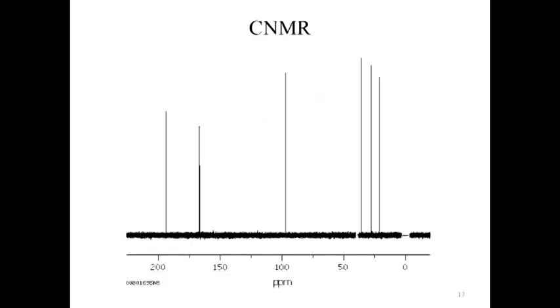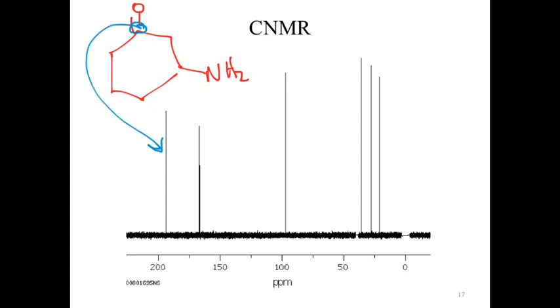Within our carbon NMR, I don't have anything extra to add to this, unfortunately. It is what it is. We could go through and look at our structure and verify that we've got indeed exactly what it asked for. We have 6 completely unique and distinct carbons. We've got our carbonyl carbon. We have this guy, which is part of our double bond and extremely electron de-shielded.